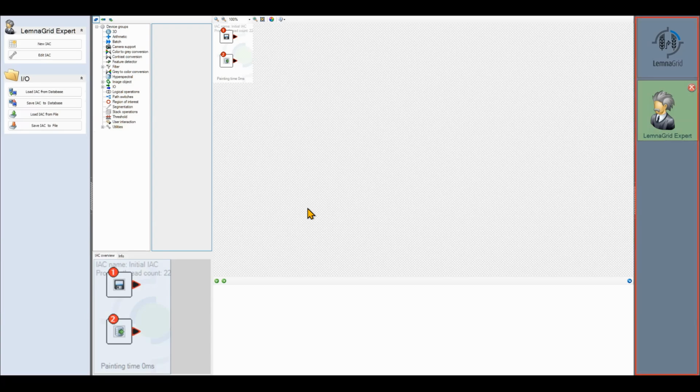Another list of buttons is on the right. This is to navigate between pages. It no longer serves any meaningful purpose.